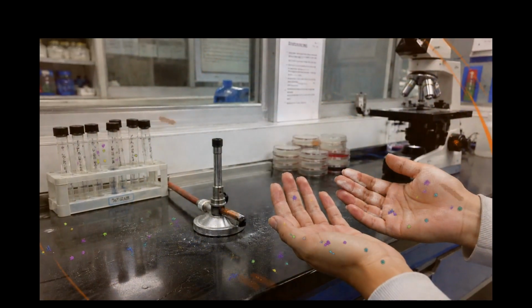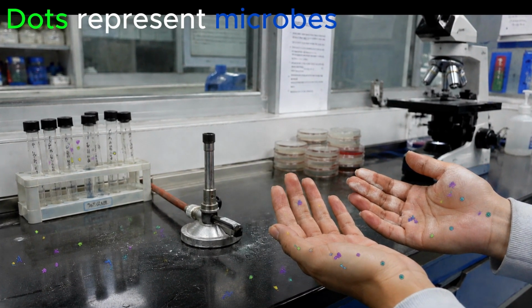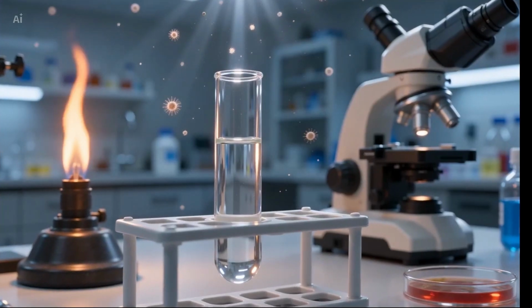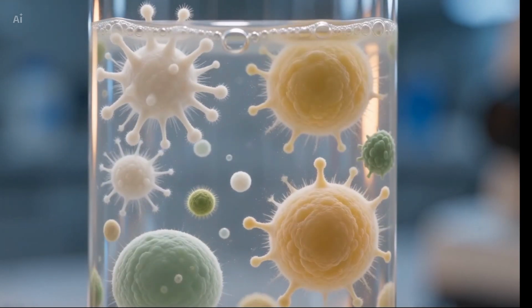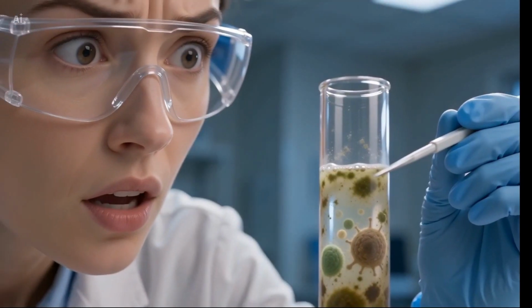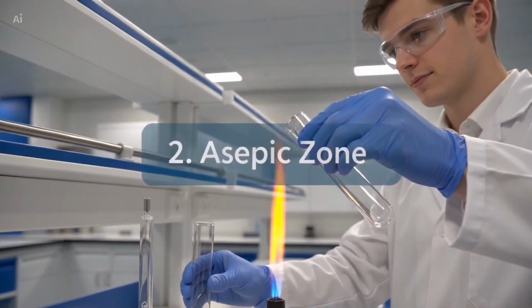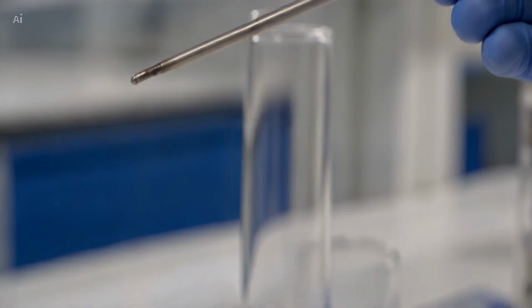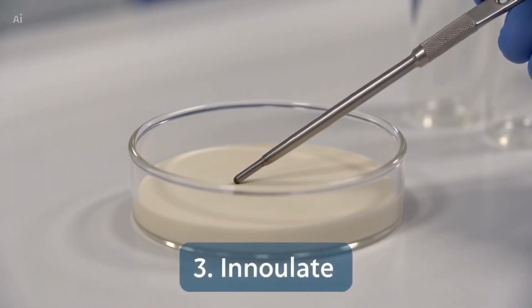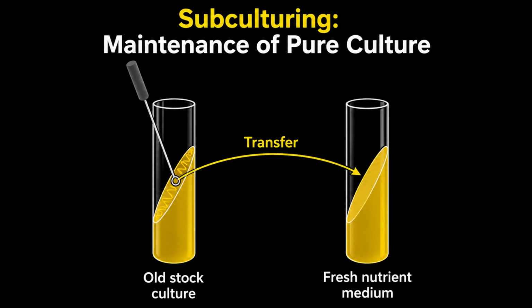Since microorganisms are naturally present in the air, on laboratory benches, and even on our hands and equipment, every transfer must be carried out carefully using aseptic techniques to prevent contamination and obtain reliable experimental results. The aim of this experiment is to learn the correct aseptic technique for transferring microorganisms from one culture medium to another without introducing contamination. The principle behind this experiment is simple.